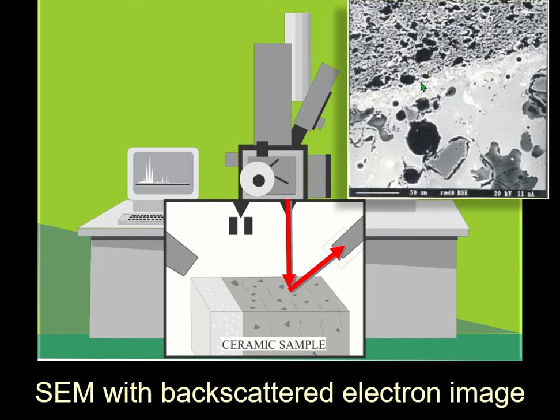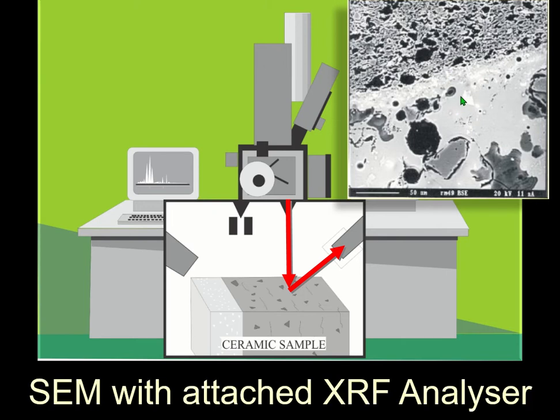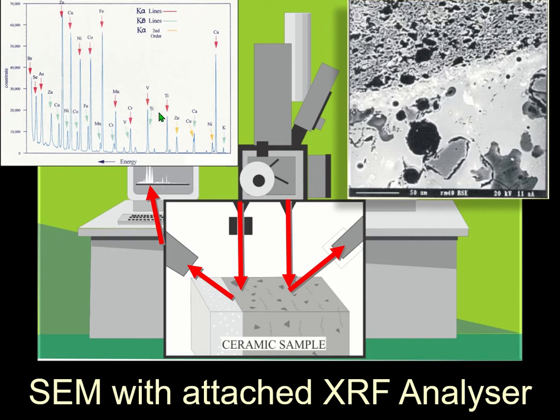So, but you can see the things which are of the same element. Composition, elemental composition. Because it's not a single element, you know, this is tin oxide. And you can also have a probe, XRF analyzer, and you bombard the sample and collect X-rays, which are of a particular wavelength of the elements within it.